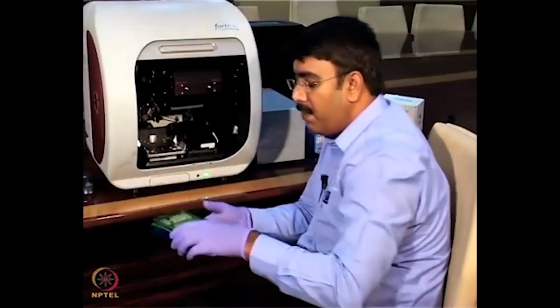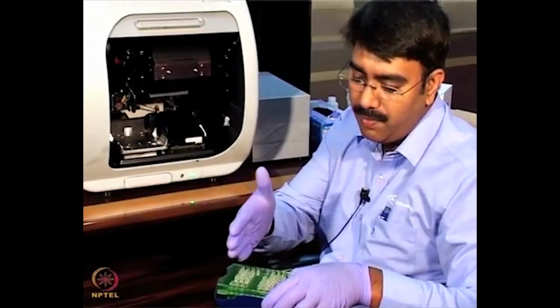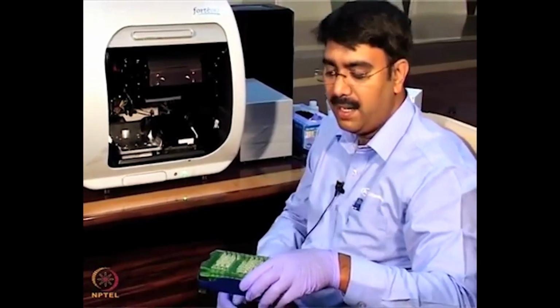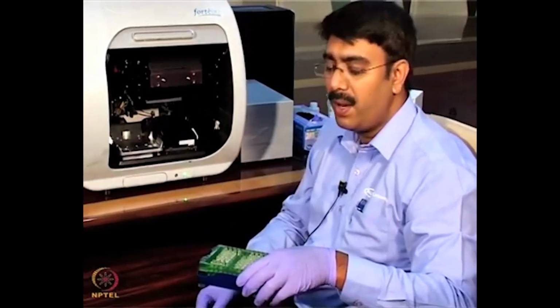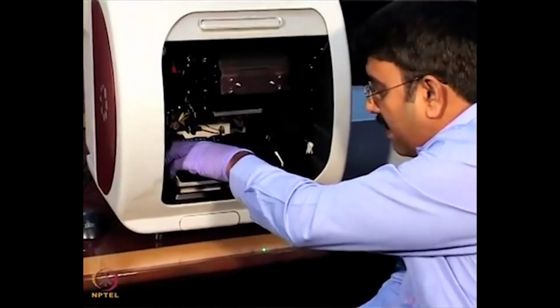So here I am going to place the sensor rack in the sensor compartment. We pick up the sensors from either column 1, column 2 or column 3, anywhere. We can program it according to the instrument. We are placing the sensor rack like this.